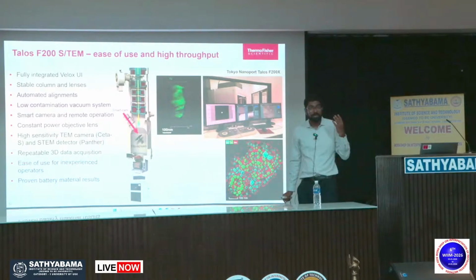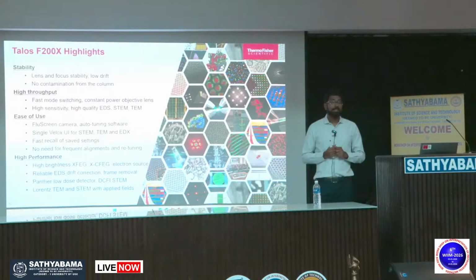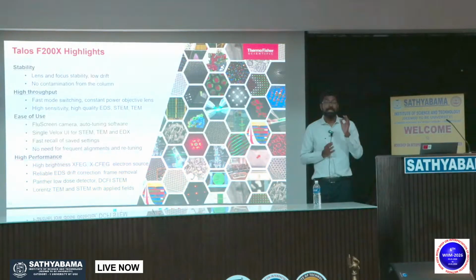The only thing, first and last words: make sure that you are interpreting the right way, either in your brain or in the software, and that you know what you are doing. Now in the AI/ML world, it can interpret anything from your image. If you ask, I want ChatGPT to do some interpretations.